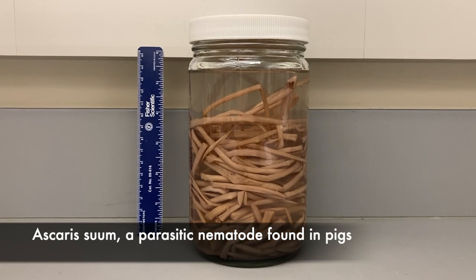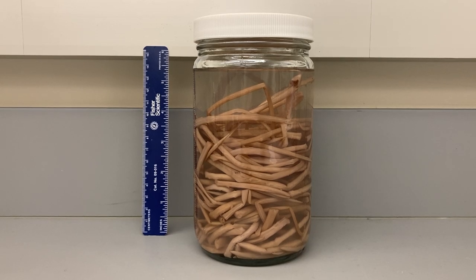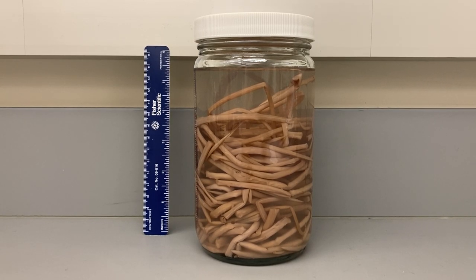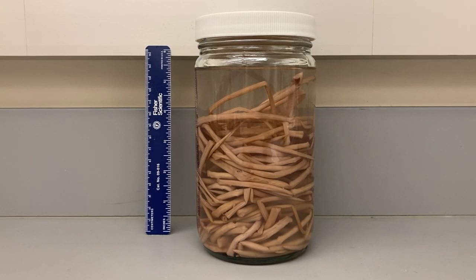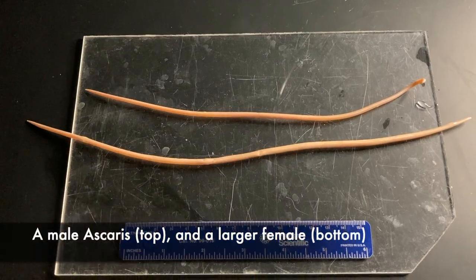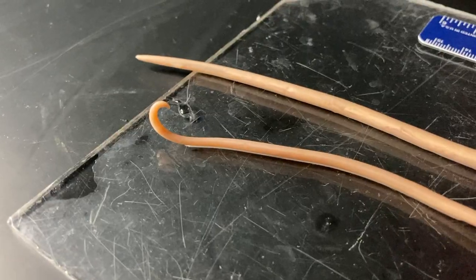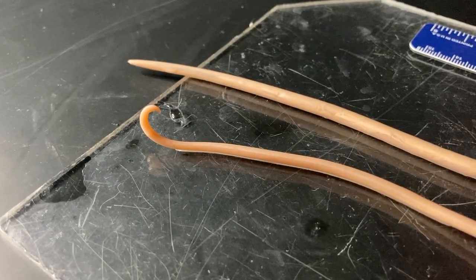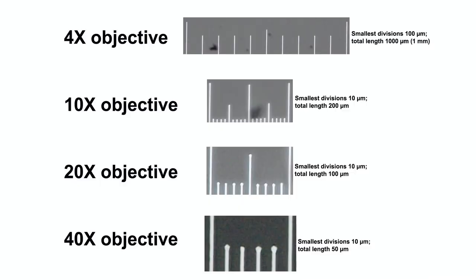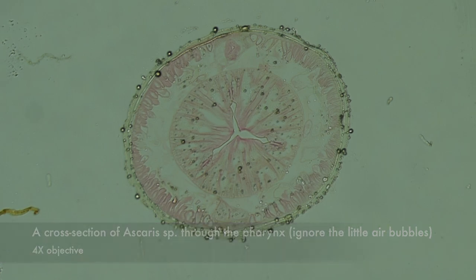There are thousands of species of parasitic nematodes. Here's a nice large one, Ascaris suum, which as an adult lives in the intestines of pigs. This jar contains maybe 50 individuals. Here are a male and female individual — the male has that typical hooked posterior end.